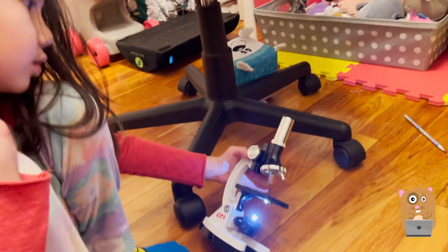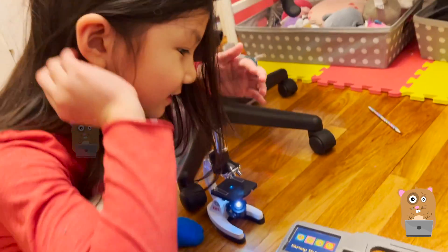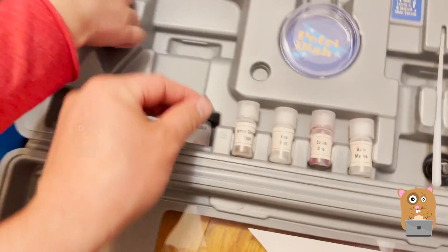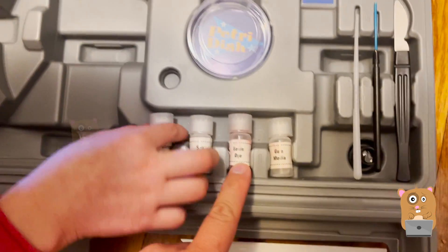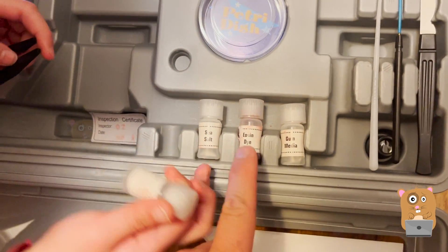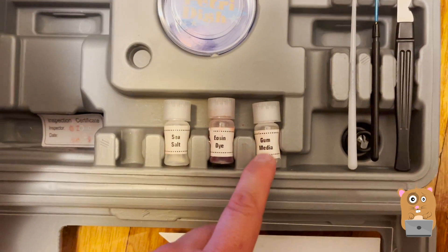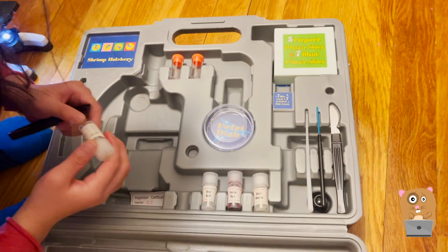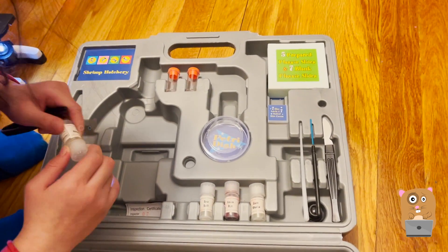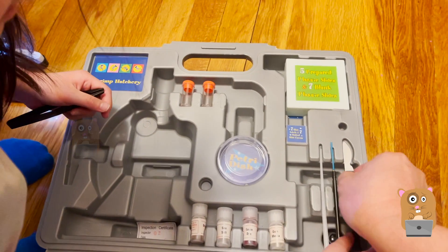I can't see anything though. You're supposed to put something on here. I'm gonna put something — let's see what we have. We have brine shrimp eggs, sea salt. Wait, what are brine shrimp eggs? I'm not sure. I had one of these kits when I was younger but didn't use it too much. Wow, they included this. Don't touch this one — it's a knife.